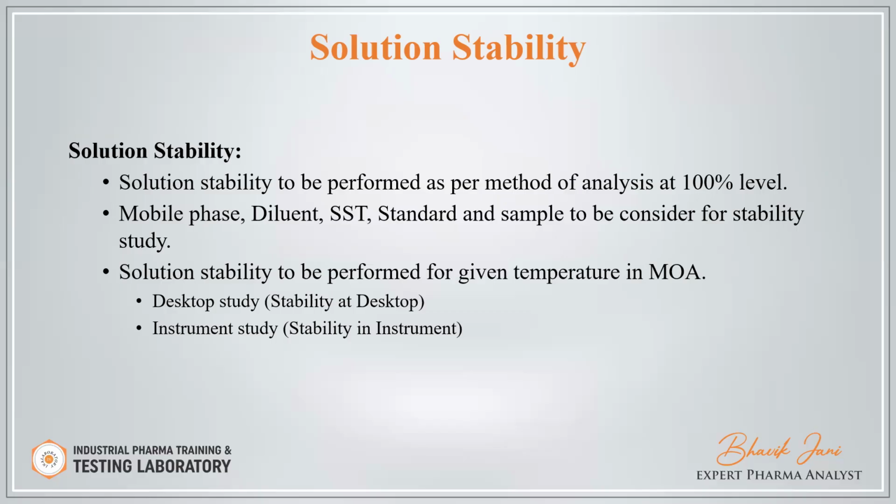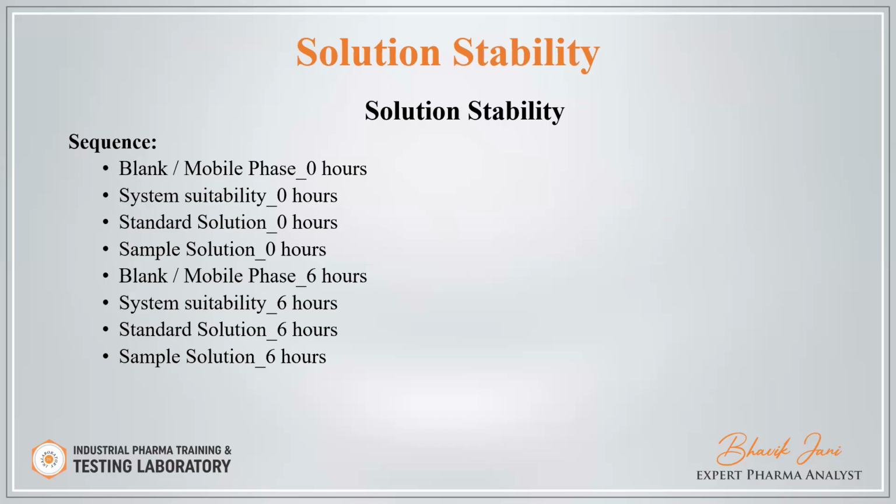You have to fill the solution from the desktop every time and inject. The sequence should be blank, mobile phase, system suitability, standard solution, sample solution. Then after 6 hours or 9 hours, 12 hours, you can inject this.